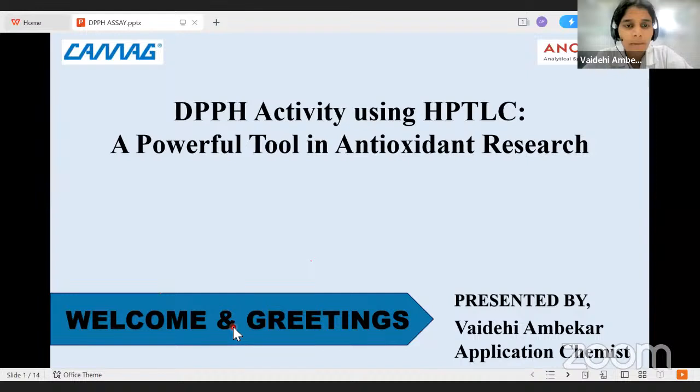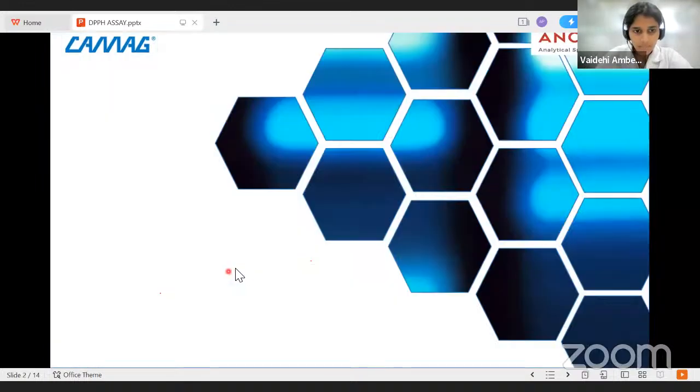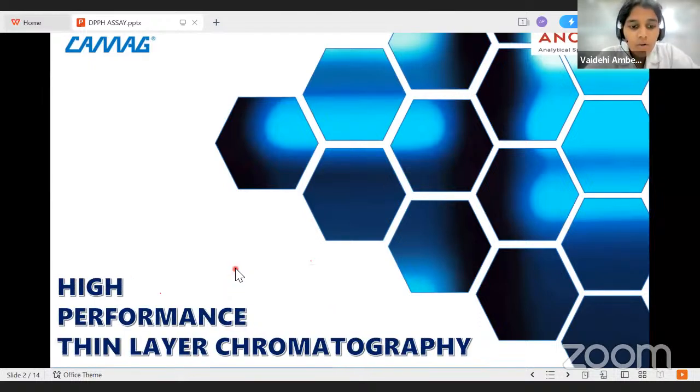Today I will be delivering a short presentation on DPPH. Before starting the presentation, I would like to say that we'll have a very short presentation about how to perform the DPPH assay. Along with that, we'll have a live demonstration on how to actually perform the DPPH assay.